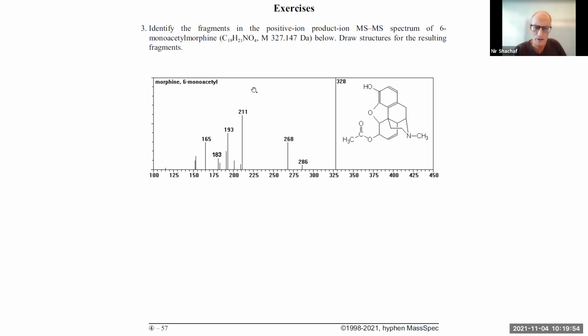In that case, the nitrogen is already gone. So, which still doesn't give any effect on the nitrogen rule, because the nitrogen rule is still valid. But I understand what you mean. Yeah, the rule is valid. It just means that basically I can assume that there is no nitrogen on these uneven numbers.